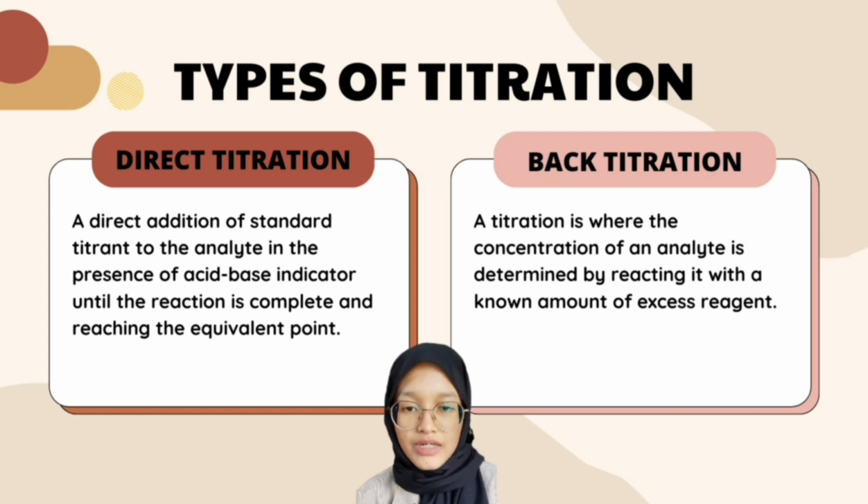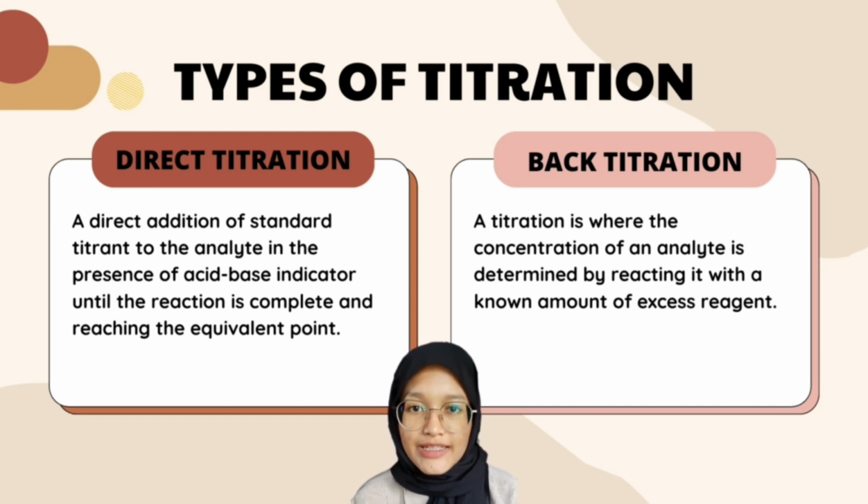I'll be presenting about the types of titration, which is direct titration and back titration. Direct titration is a direct addition of standard titrant to the analyte in the presence of acid-base indicator until the reaction is complete and reaching the equivalence point.